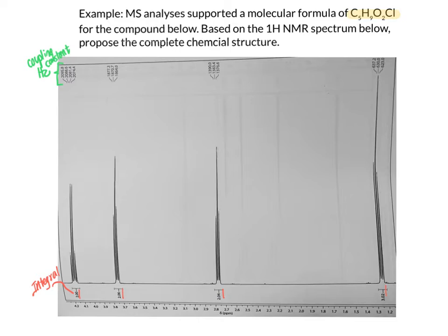The only exception is occasionally if you have a hydroxy group or an amine group that has a hydrogen bonded to it. Those hydrogens are what we refer to as exchangeable protons because they can be lost and gained quickly in acid-base reactions. As a result, they often are not seen in the NMR spectra. Instead, they are invisible. So if you notice that there is a difference between the integral total down here and your formula, it usually means that one of your protons is part of a hydroxy group or an amine group, so that it is an exchangeable proton that will be invisible in many NMR experiments. But here, everything adds up. 2 plus 2 plus 2 plus 3 equals a grand total of 9 protons. So all of those are accounted for based on our integral values.